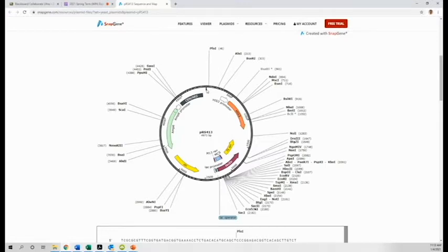Then you go in the clockwise direction all the way to the end, so the size is 4970. The last sequence here will be 4969, and then 4970.